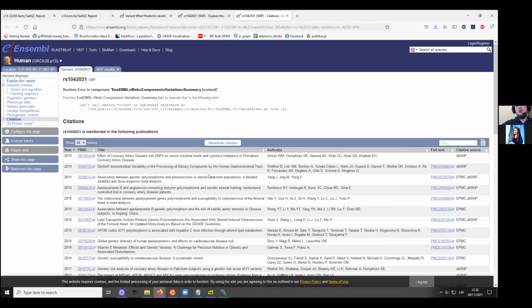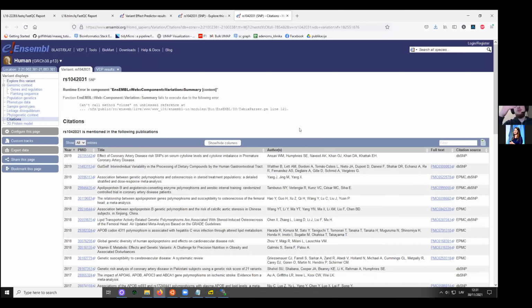But the problem here is that we only have one sample. Ideally, we would have multiple samples to cross-reference, because a result from one sample might be there by chance. Even though we have read coverage and good mapping quality, it's still better to use samples from multiple people with the same disease phenotype, for example, to improve the confidence that the detected polymorphism is actually there.